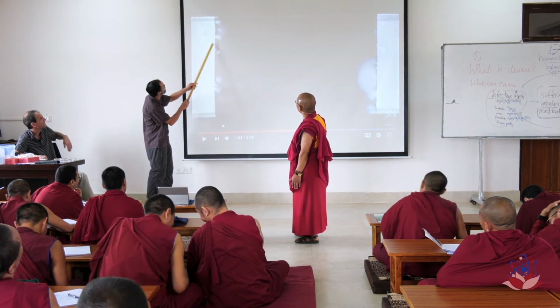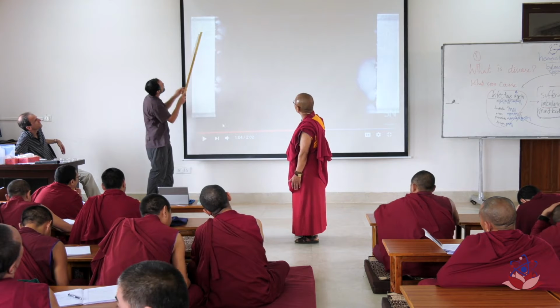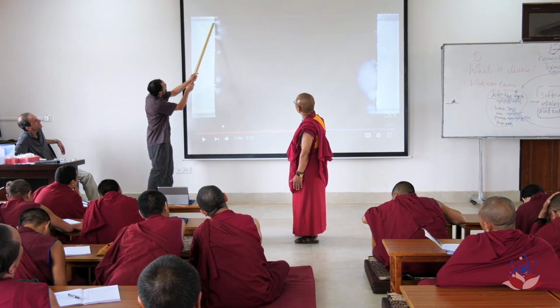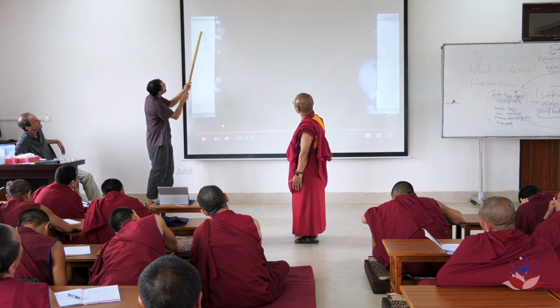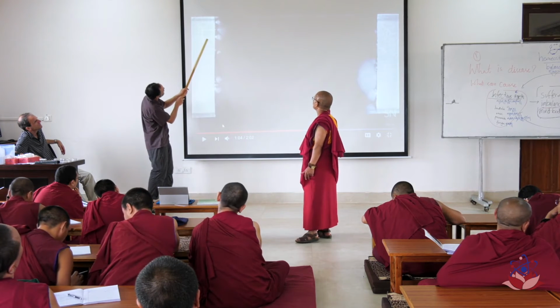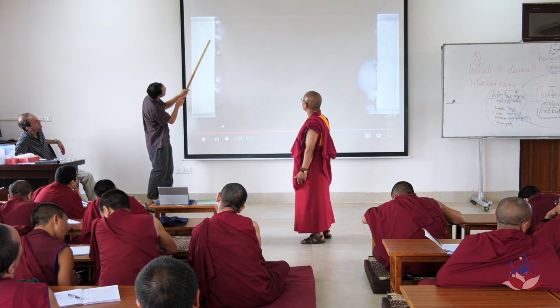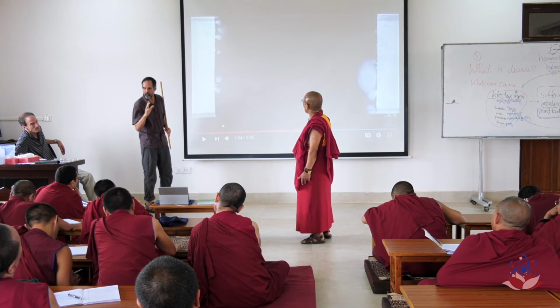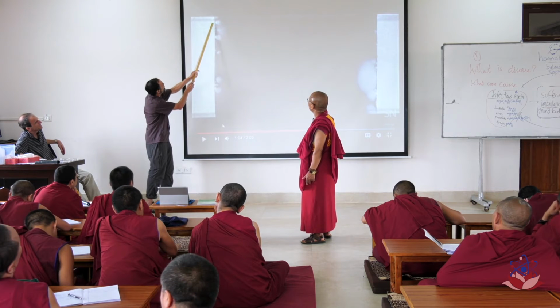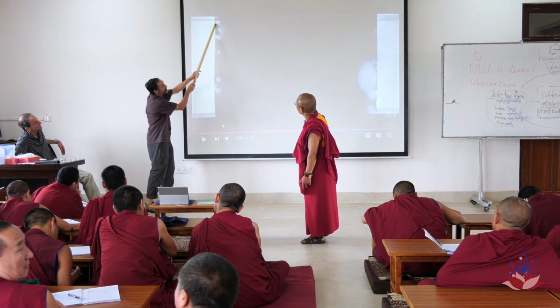Okay? Billions of bacteria here. But look at this. Here's a line growing out and then whoop, there's a clone. Here's another line growing out. Whoop, there's a clone. And I don't know, maybe this is one starting here. So there's a correlation between these piled up colonies and resistance.